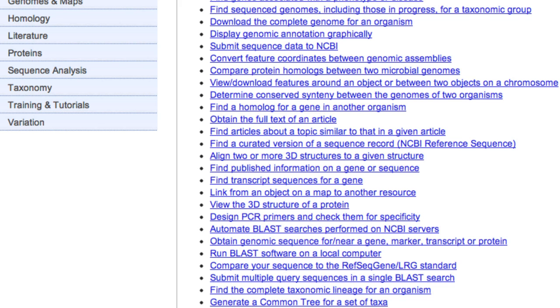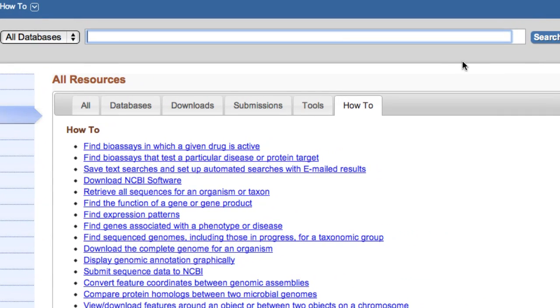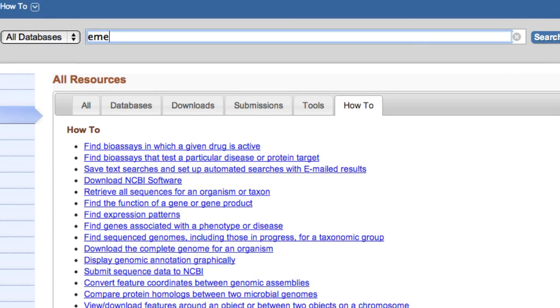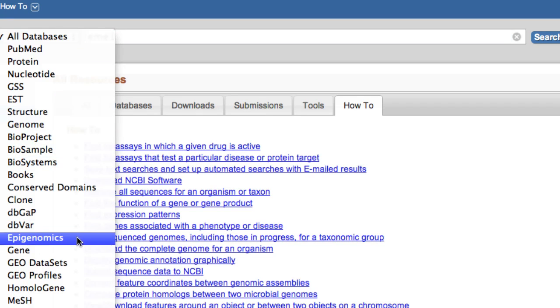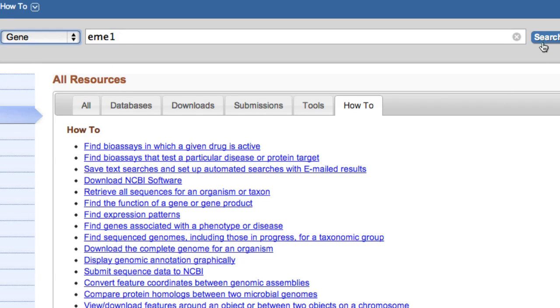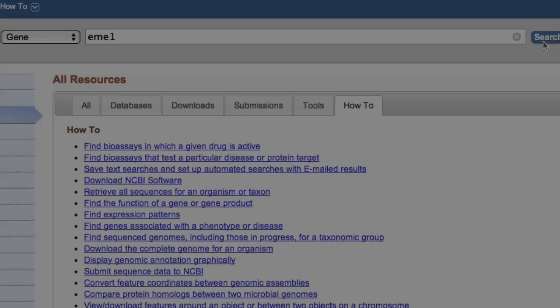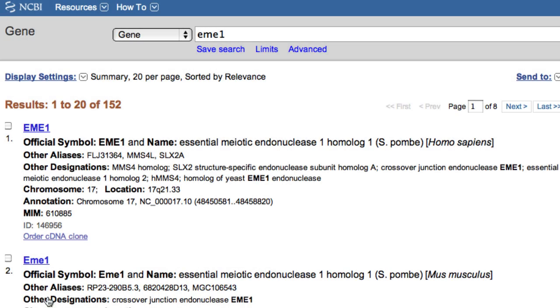Let's get sequence for the human EME1 gene. I'll type EME1, select the gene database, and click search. Open the record by clicking the gene name.